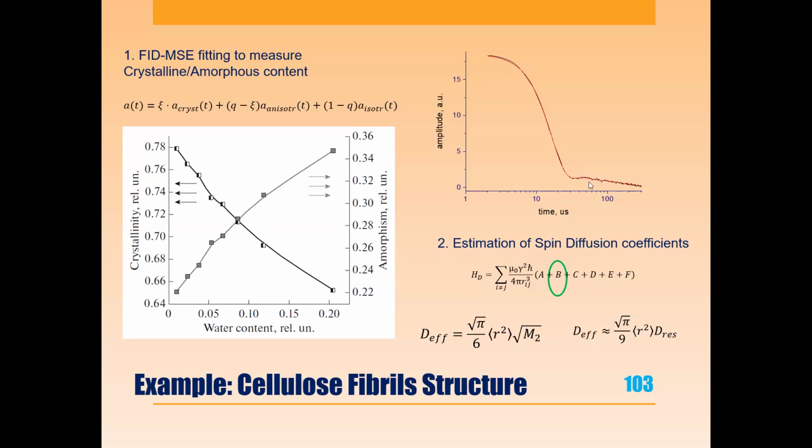On the typical FID signal recorded with the magic sandwich echo, it has a fast decaying component, and then it has oscillation and a slow decaying component. After today's discussion, we understand that fast decaying is something rigid, something solid, and slow decaying is not really solid. It can be liquid or whatever. And coming back to the beginning of today, we are going to consider different methods.